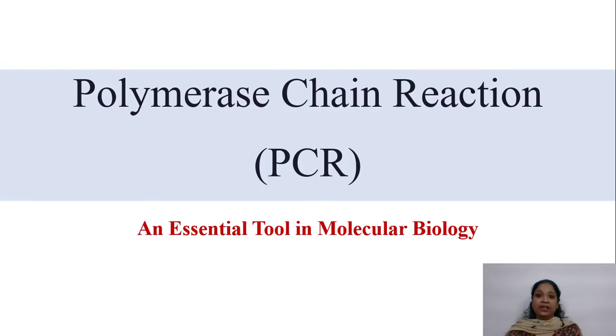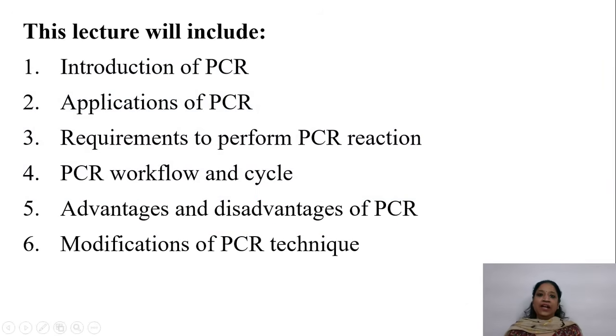What's truly fascinating is how PCR has become a keystone for so many fields such as medicine, agriculture, forensic science, and beyond. It's one of those techniques where you stop and think, what would science look like without it? In this lecture, I will cover the following aspects: introduction of PCR, application of PCR, requirements to perform PCR reaction, PCR workflow and cycle, advantages and disadvantages of PCR, and finally, the modifications of PCR techniques.